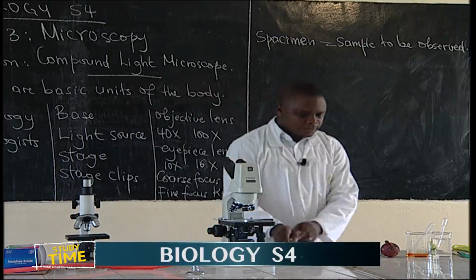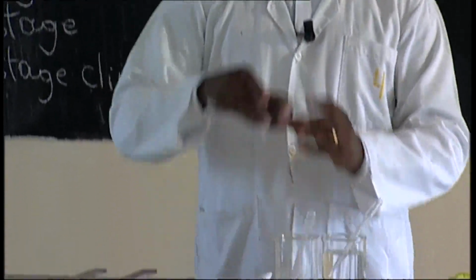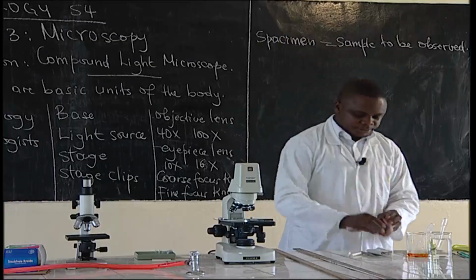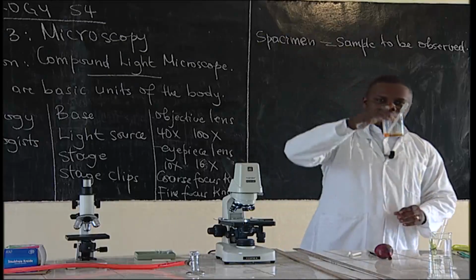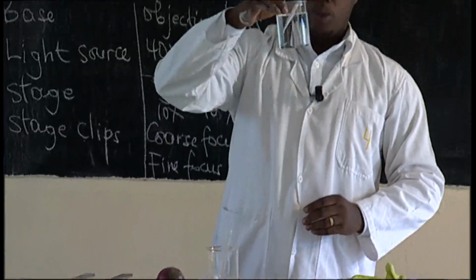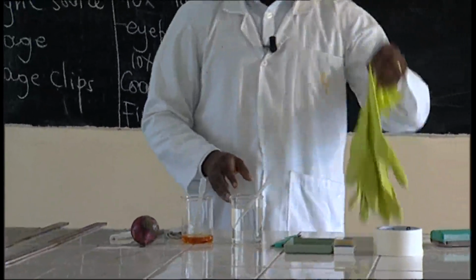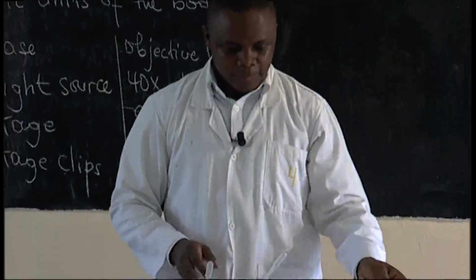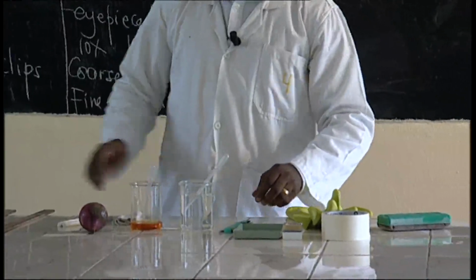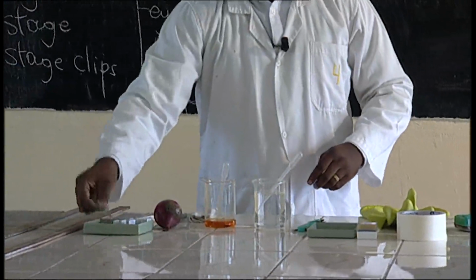Here I have the onion. I have iodine solution. I have water. And I have gloves. I have what we call slides.